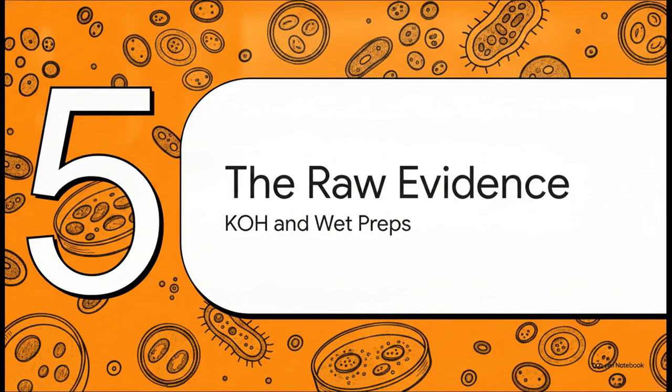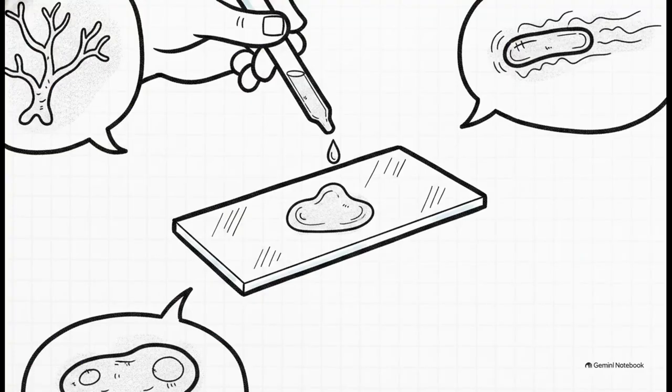Finally, we reach Section 5, the raw evidence, KOH, and wet preps. Sometimes the absolute best way to catch a suspect isn't with complicated chemical stains, but by observing them in their raw, unfiltered environment. We're talking about direct windows into the wild microscopic world.